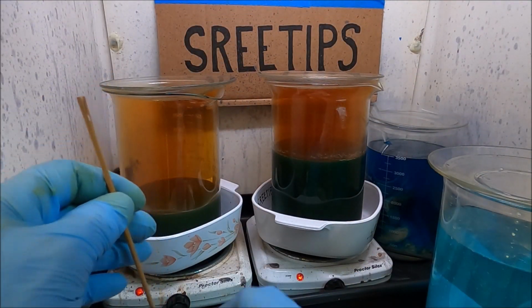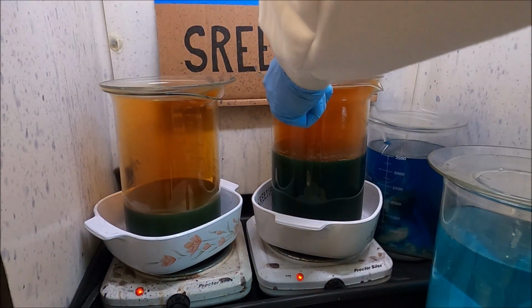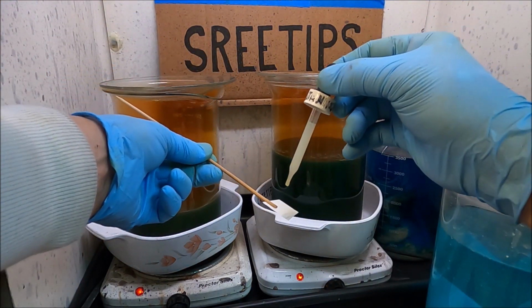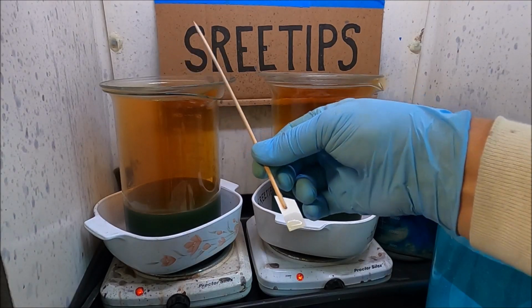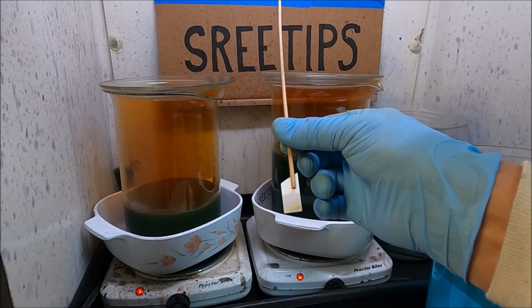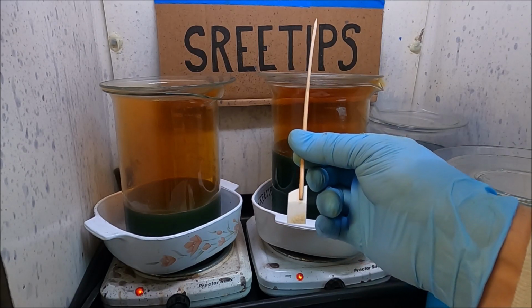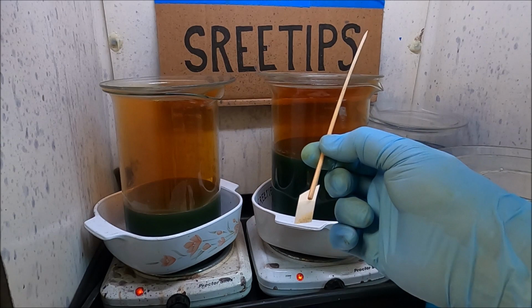Got a bamboo skewer here. I'm going to get a piece of filter paper and stick it down into our solution here. Put a little bit on the corner of that piece of filter paper there. Now we're going to do a stannous test on this sample here and see what we got going into solution. Looks like we're getting a slight orange indication there. The back is turning brown. I see brown and orange. Looks like we got a little bit of platinum, maybe a little bit of palladium. Mostly platinum, I guess, judging by that test.